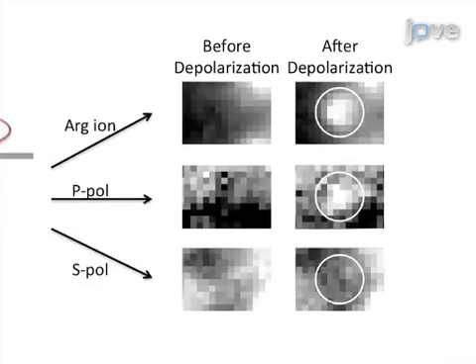Ultimately, pTIRFM is used to acquire images in real time to monitor the membrane topological changes that result from chromaffin cell exocytosis. The main advantage of this technique over existing methods like amperometry and membrane capacitance is that pTIRF reports membrane curvature and, by extension, fusion pore dilation directly.